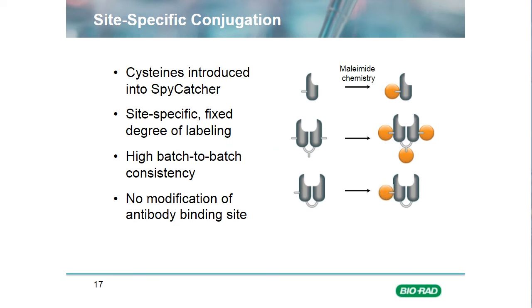Now, where antibodies are going to be used as secondary antibodies or detection antibodies, or even, say, capture antibodies are going to be biotinylated for the application, there is a need to consider conjugation. So labeling to enzymes, fluorophores, or carrier proteins is traditionally a semi-random process involving some kind of chemical coupling technique. So most commonly with antibodies, coupling is done to primary amines on the lysines, but there are also other methods such as sulfhydryl coupling.